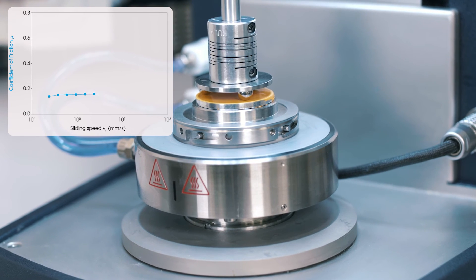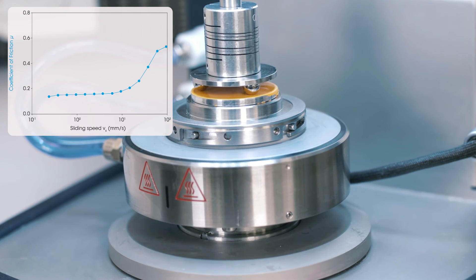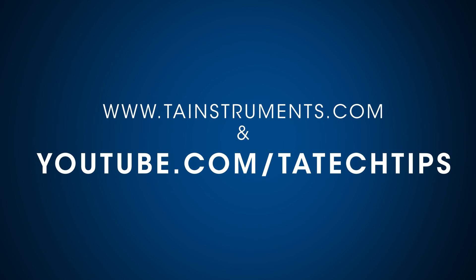Here is one example of testing the coefficient of friction on a paint coating surface. In this TA Tech Tip, we have learned how to set up the three ball on plate geometry on a Discovery Hybrid Rheometer. We have also shown you how to set up a flow test procedure to measure the coefficient of friction as a function of sliding speed. Please stay tuned for more helpful TA Tech Tips. Thank you for your interest. Take care.